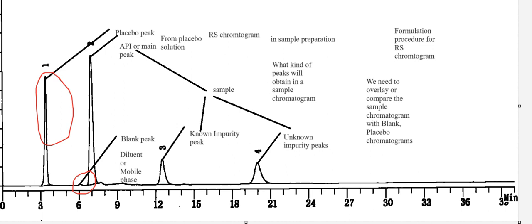To identify the retention time of the main peak and known impurities, we will inject the system suitability solution, or what we generally call the SST solution.